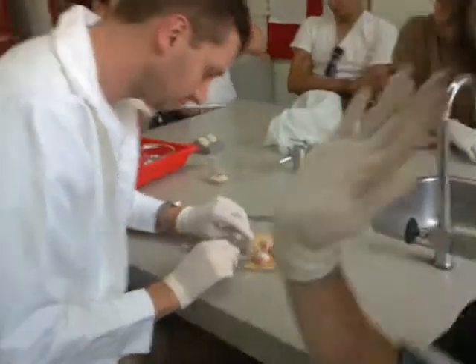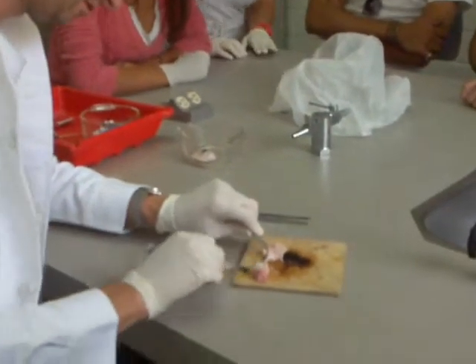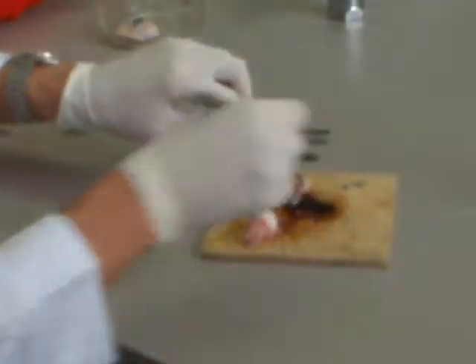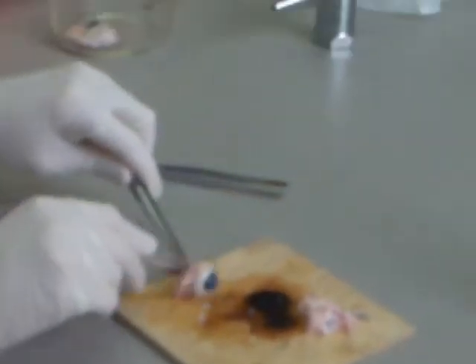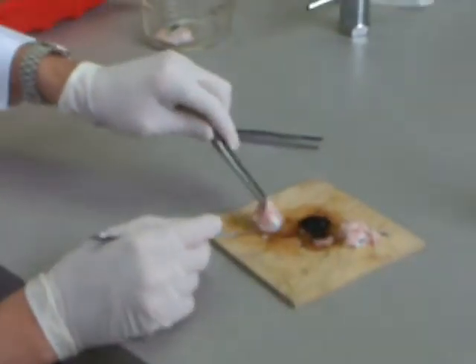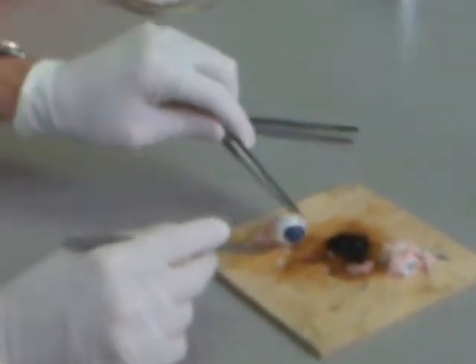So we cut away all the muscle. We've got a little bit of muscle left, we'll just get rid of that. That's a small eye. That was a baby pig — it probably was, actually. And you can still see the end of the optic nerve.